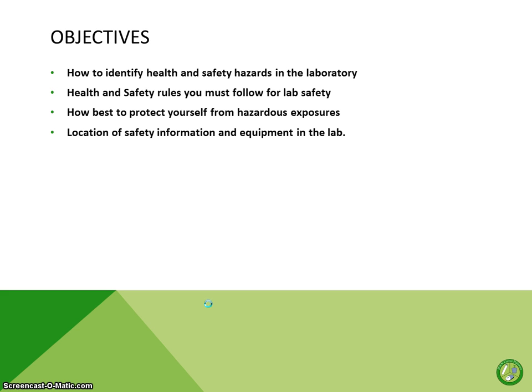Let's review the objectives. After this presentation, I would like you to know how to identify health and safety hazards in the lab, health and safety rules you must follow for the lab safety, how best to protect yourself from hazardous exposures, and location of safety information and equipment in the lab.